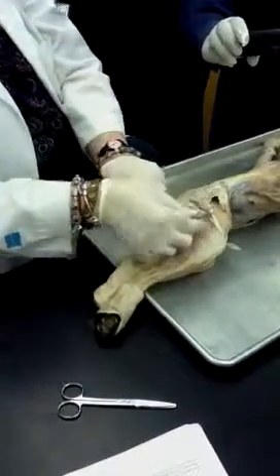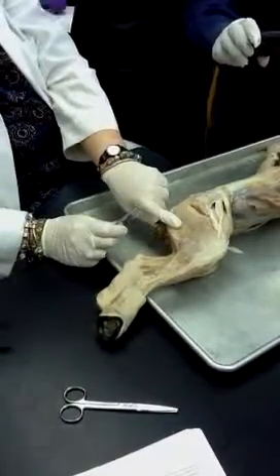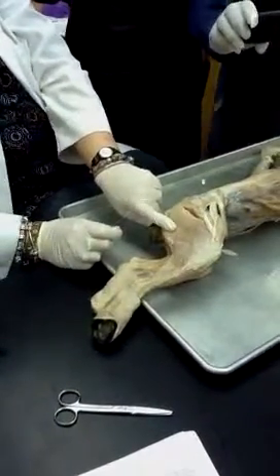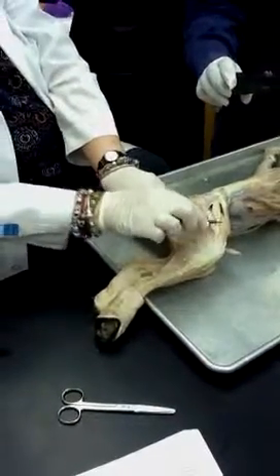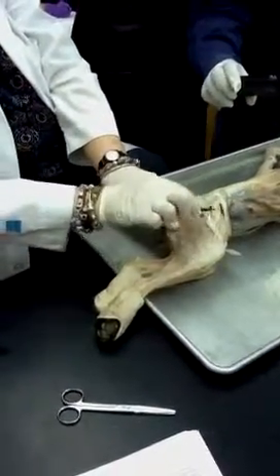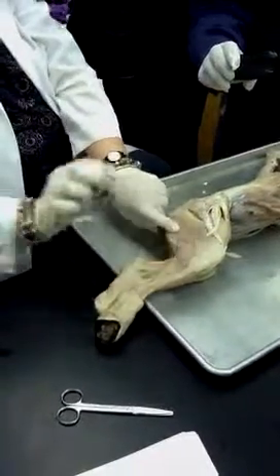This muscle that's torn, that has a lot of white, is our tensor fasciae latae. Remember that little song? Tensor fasciae latae has a lot of latte, like a latte has a lot of white foam. That's a pop hit on the radio, the top 40.